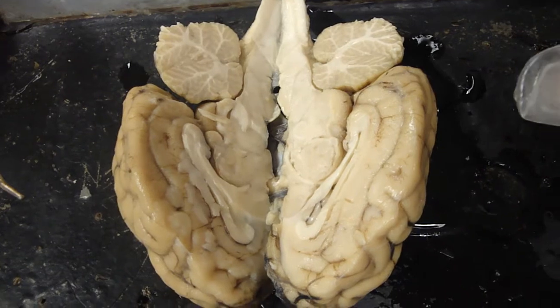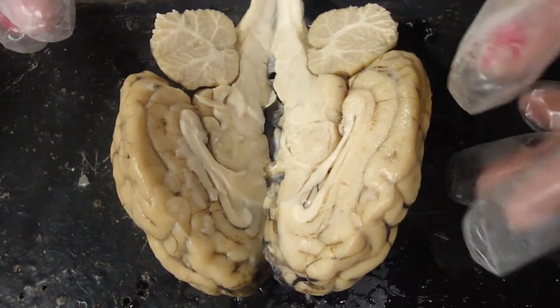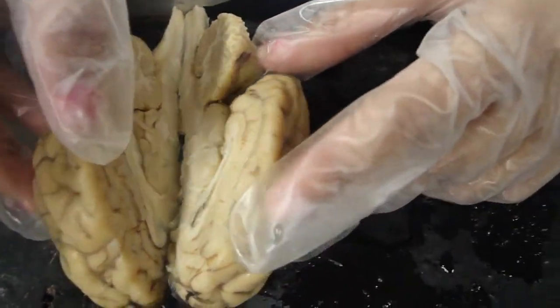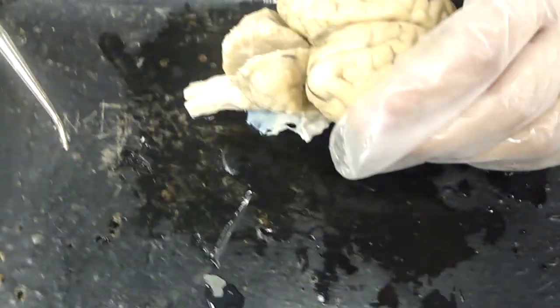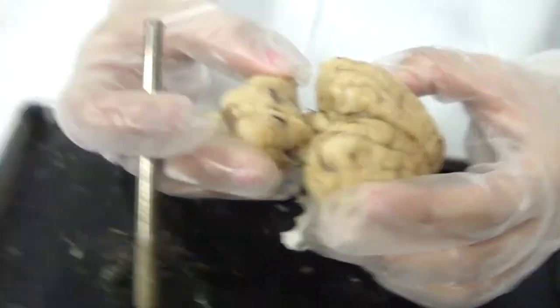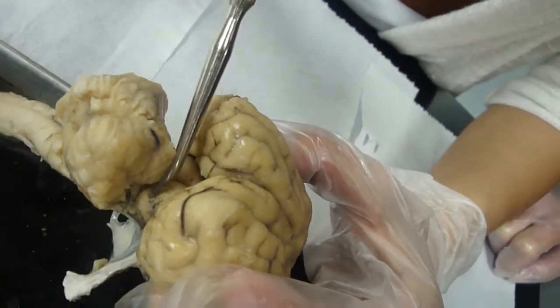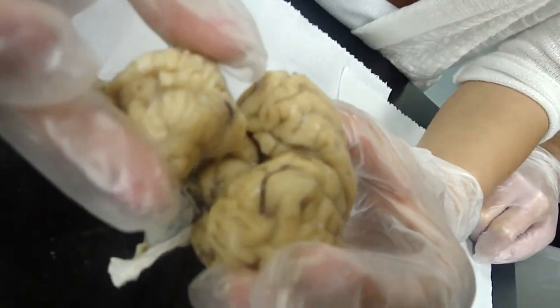From the interior view, what you do is you fold the brain open a little bit, so that you can look at this region between the halves of the cerebrum and the cerebellum. Take your hands and try to separate the cerebrum from the cerebellum. Now kind of bend it like this. We have a superior colliculus, a large rounded body here, and an inferior colliculus, this smaller body here, and you're going to bend it open. Looks like someone's mooning you.